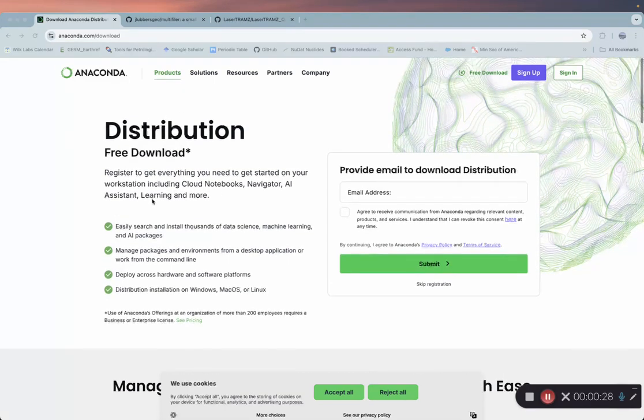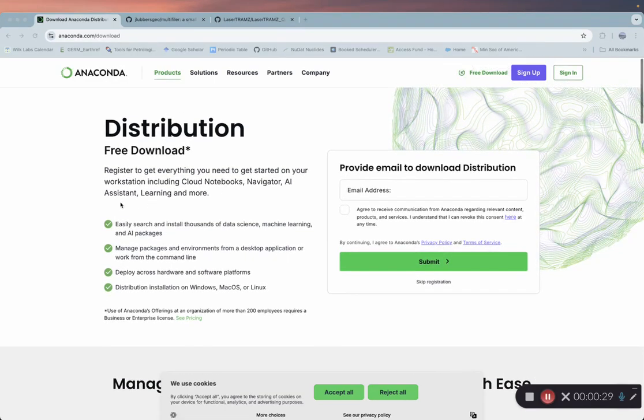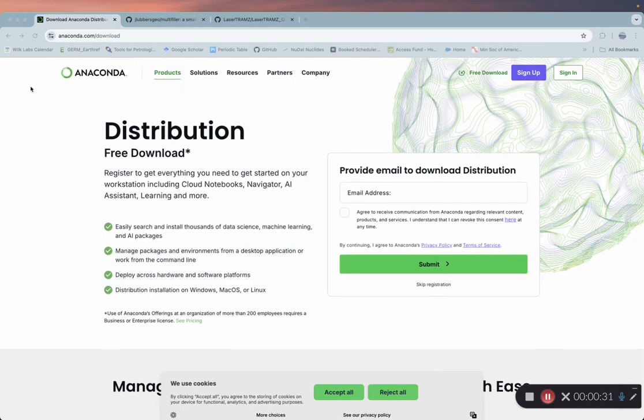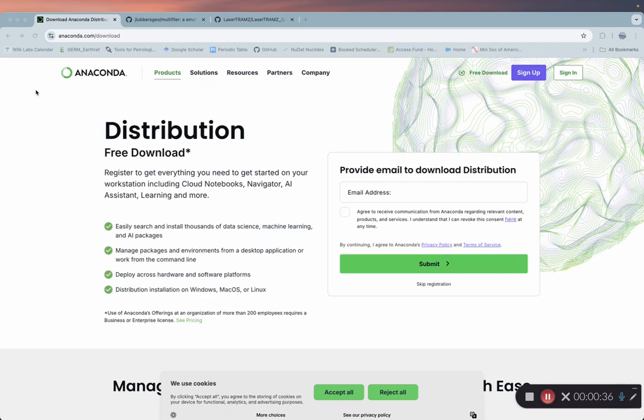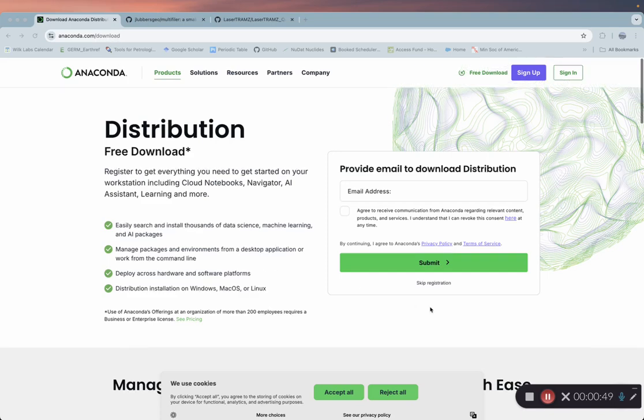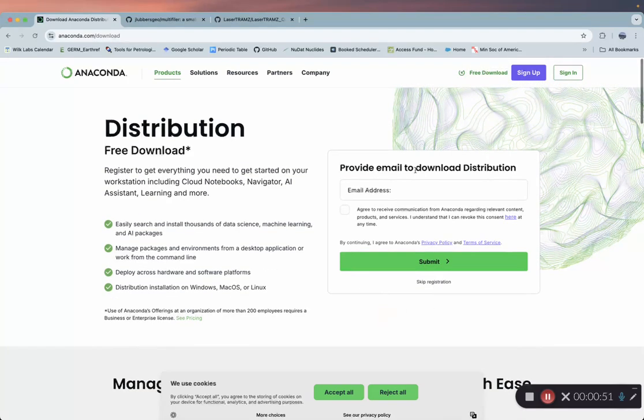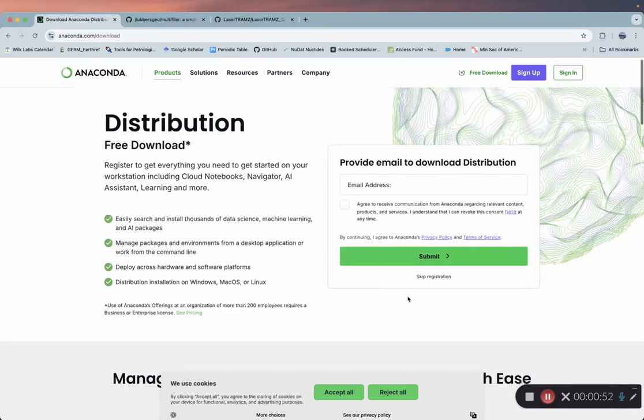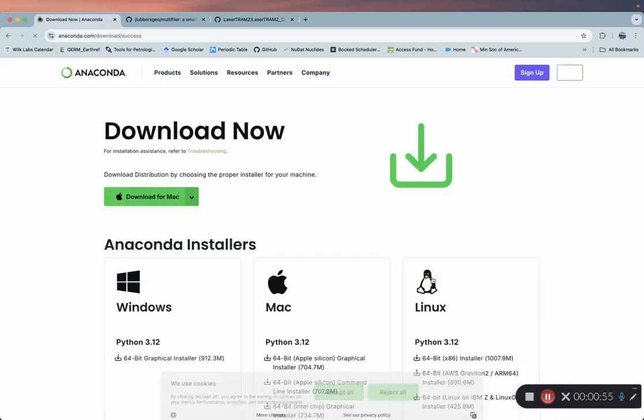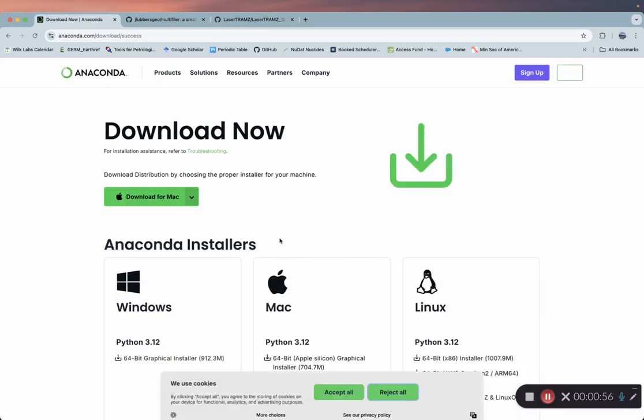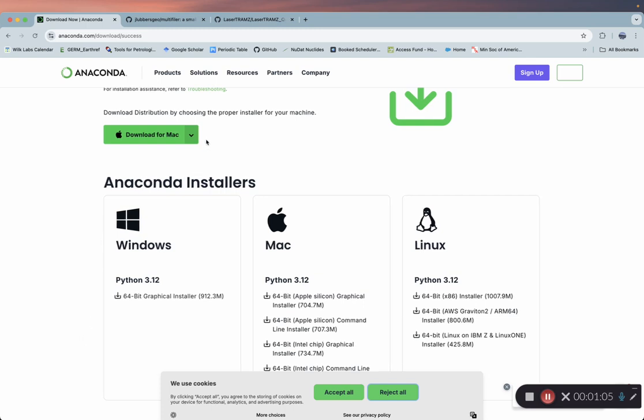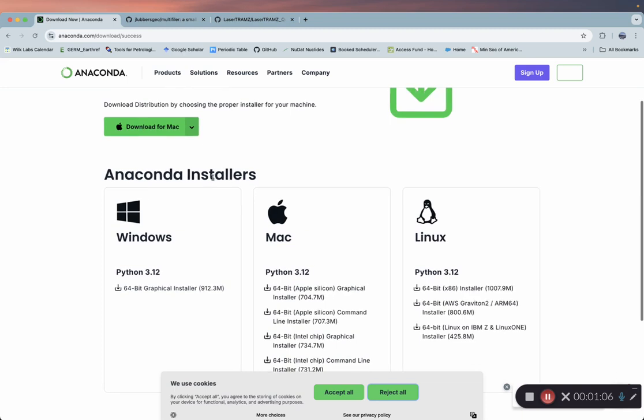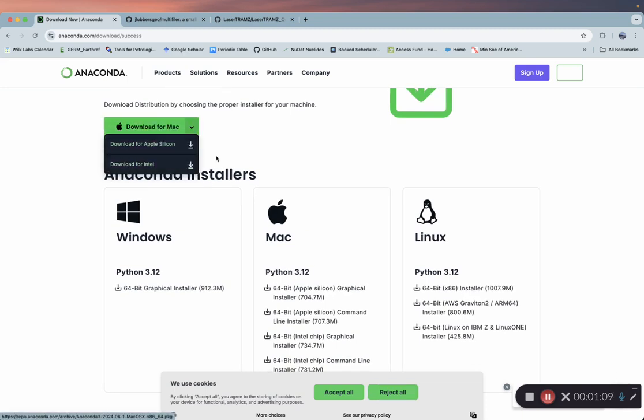First things first, we need to download Anaconda. Anaconda is going to install Python as well as various packages and libraries. It's going to allow you to manage virtual environments, which we'll get to in just a second. If you go to anaconda.com/download, you can skip registration and download the correct installer for your system. I already have Anaconda installed, so I'm not going to do that.